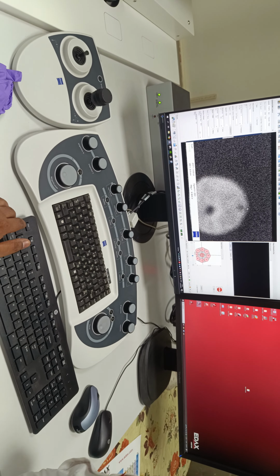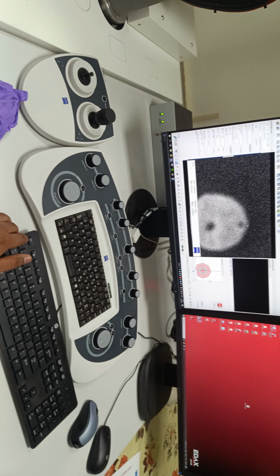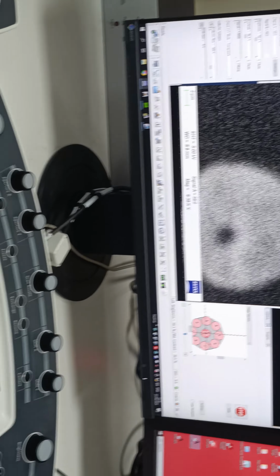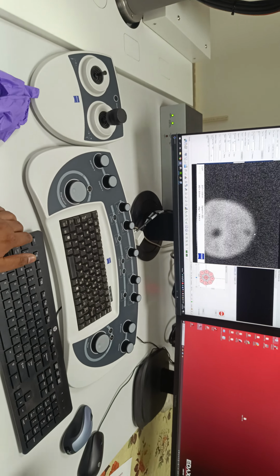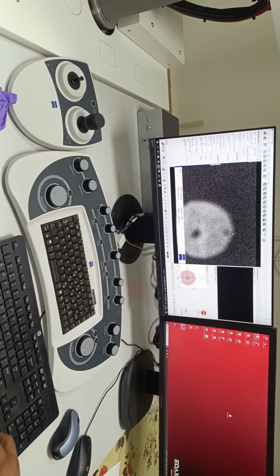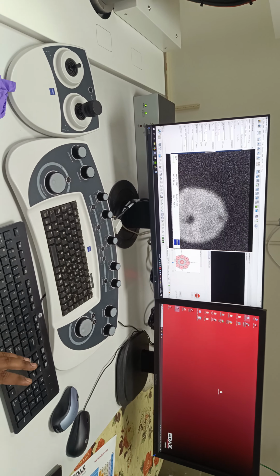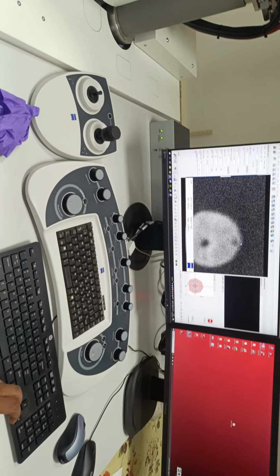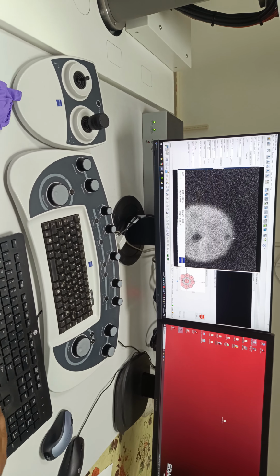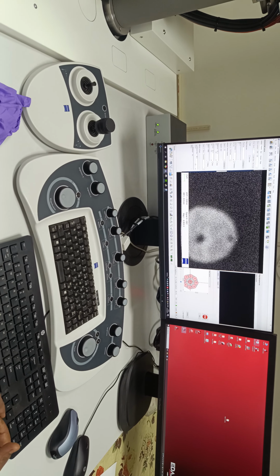In variable pressure mode, since we introduce nitrogen, the electron signal actually reaching the detector is a bit lower than in HV, because the generated electrons also face challenges reaching the detector. So we have to optimize, and we can increase it a little bit, not a very big difference in comparison to the HV system.